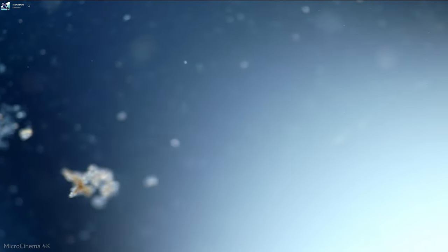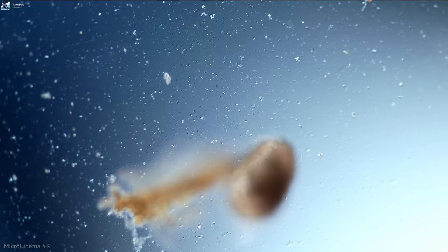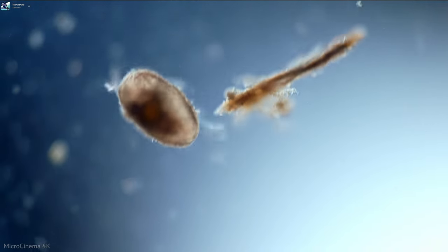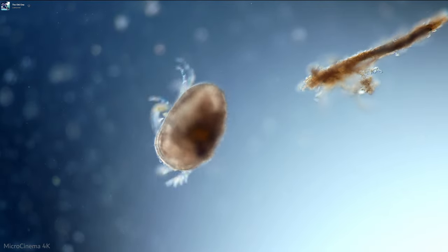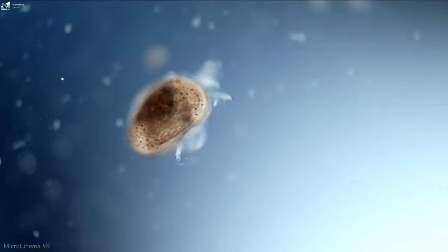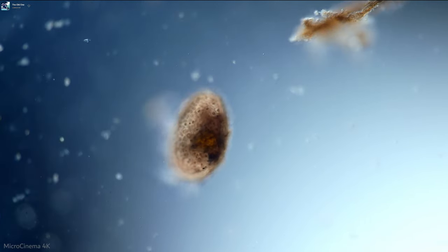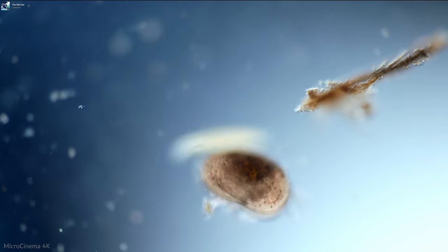One thing that I found, so normally when I use my plankton net, I don't get too many ciliates. And there's this little, it's kind of like an ostracod, but it must be an ostracod, but it's a different kind of ostracod than I'm used to. It's a more spidery kind of crawling ostracod than a swimmer. Even in the dish, it was sort of just kind of walking around at the bottom. Yeah, here we go. Okay.